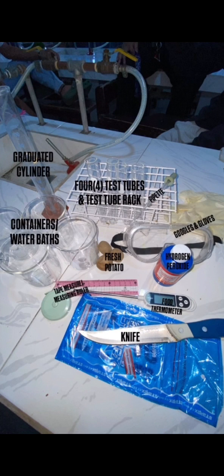Fresh potato serves as the natural source of catalase enzyme. Hydrogen peroxide, 3%, acts as the substrate. 4 test tubes and a test tube rack to hold and organize the samples. Containers or water baths set at different temperatures: 0 degrees Celsius, 25 degrees Celsius, 37 degrees Celsius, and 100 degrees Celsius. Food thermometer to monitor water bath temperatures.